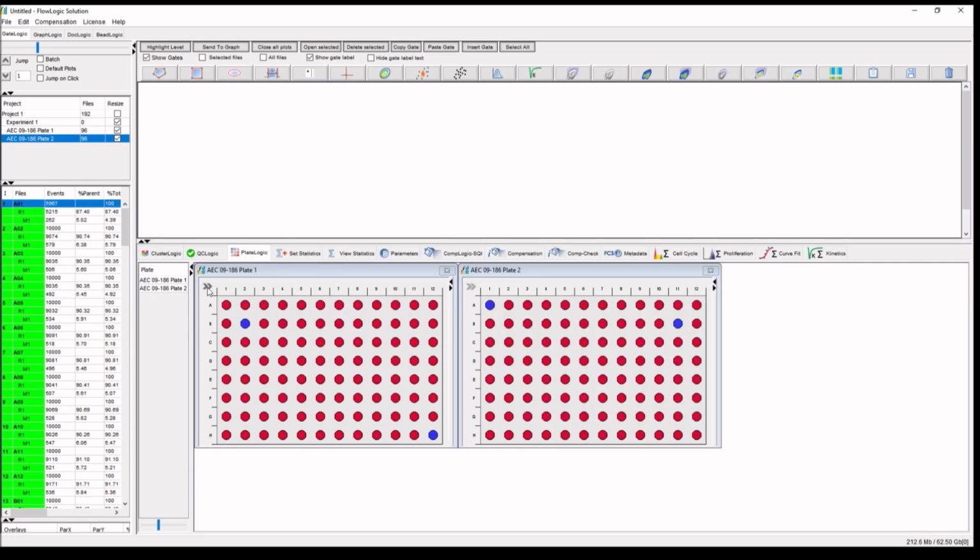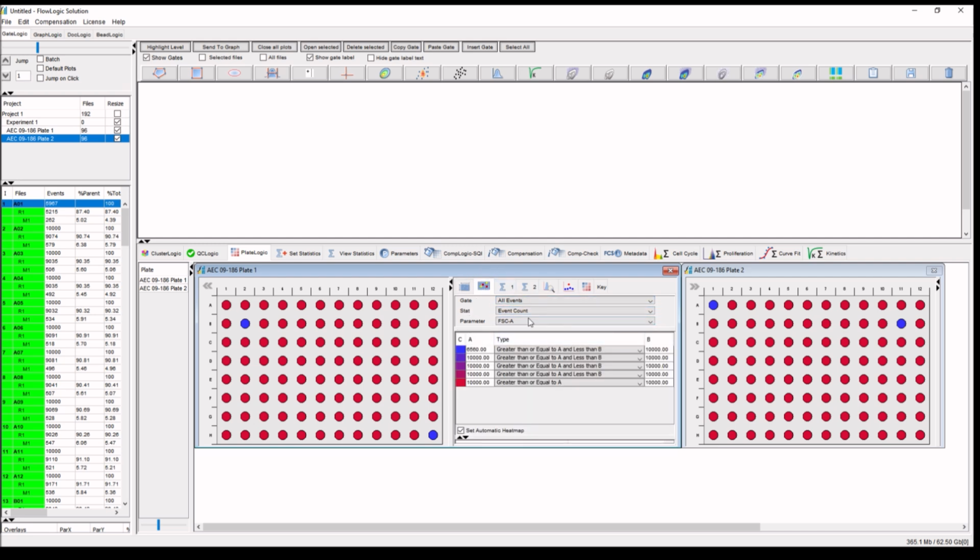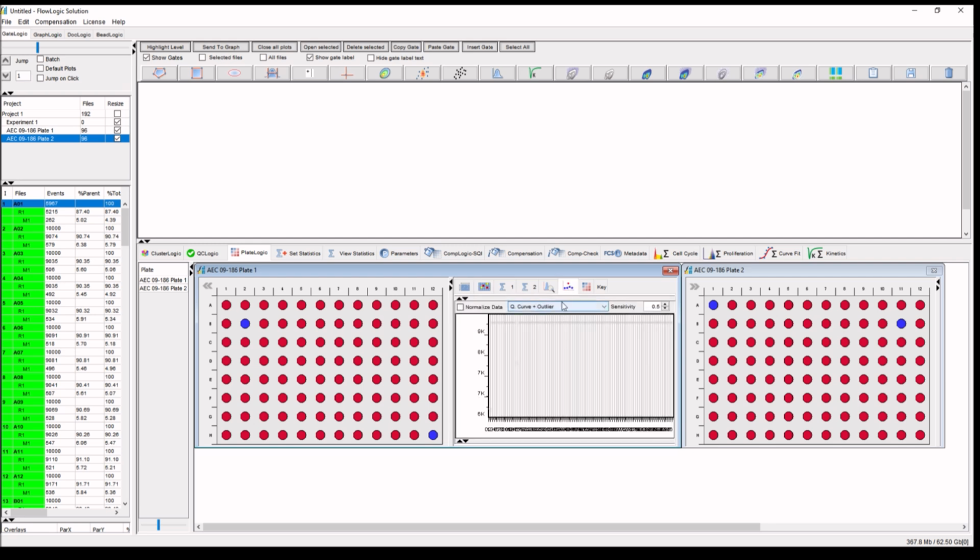So now what we do, we go to our plate, and this is the new area that we developed. We have the group settings, which means when it's ticked, if you have multiple groups, let's say multiple data sets, day 1, day 2, day 3, day 4, it makes sure that the setting you're doing for one group is reflected in all the groups. And you can change it in multiple places. If we go here, we have this one as well.